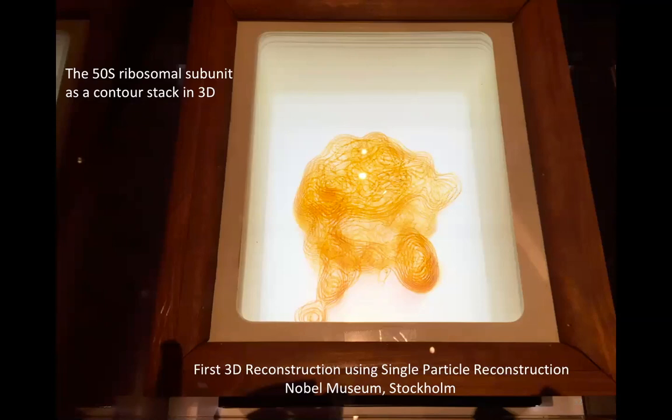Each section of the 3D structure in the computer was represented as a contour, and then we put all the contours together with the right kind of Z distance and mounted them in a wooden box.